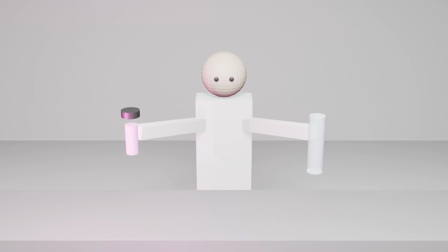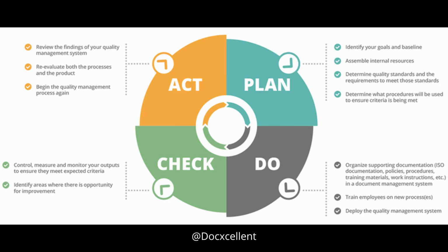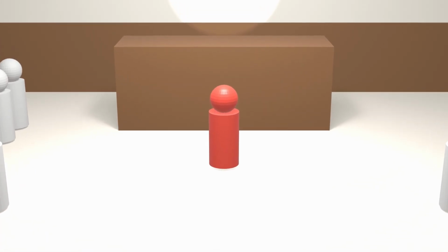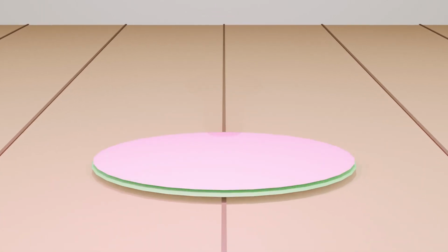Finally, when conducting any scientific procedure on an unknown, remember to always document the use of positive and negative controls before administering the test. This acts as a quality control measure and improves reliability and integrity by ensuring that the reagents used are working properly. It protects the technician's actions in court, and it helps reduce the potential for contaminants that may create false positives.